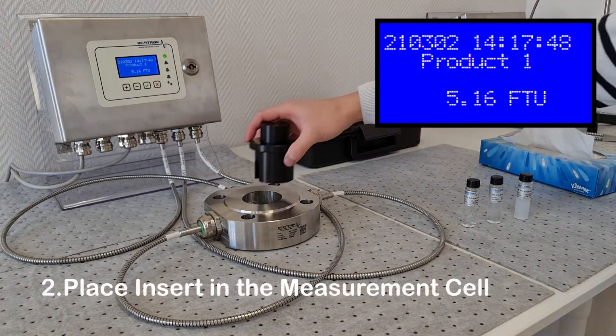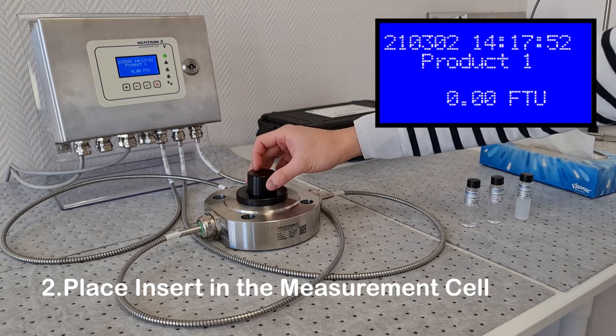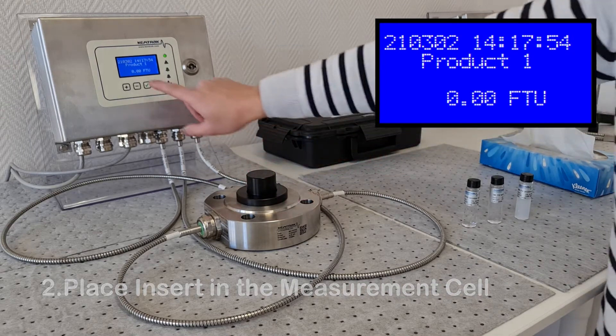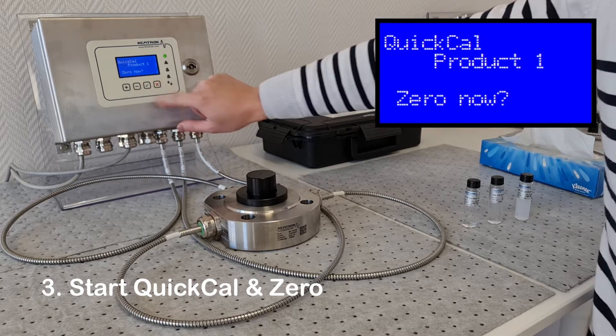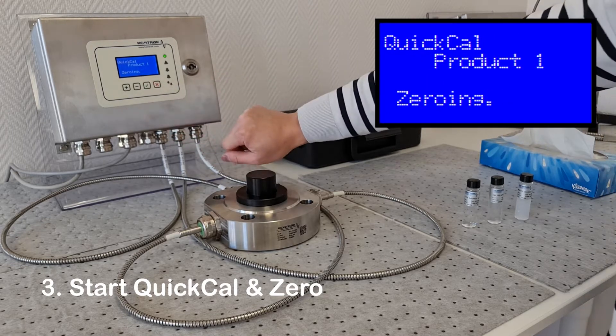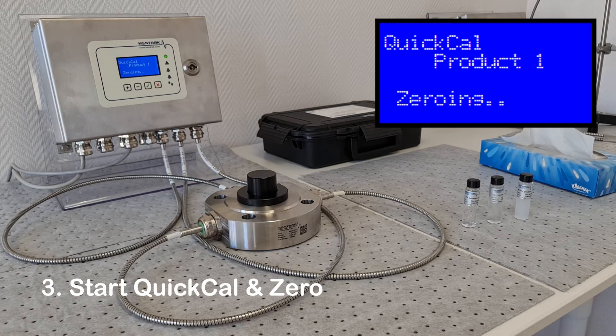Once dry, place the measurement cell insert in the measurement cell. Start the calibration by entering the product config menu on the analyzer, then select QuickCal. The calibration will start by zeroing the analyzer using the empty measurement cell insert.